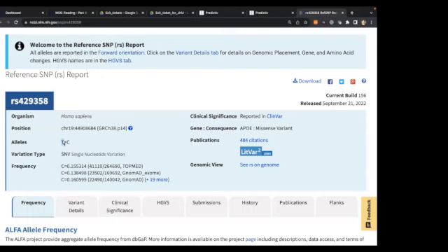Exactly. By default, even though a gene is located in the reverse direction, in the dbSNP database they always change it to the forward direction. So BRCA1 is actually located in the reverse direction, but if you look up the dbSNP data, every sequence is translated into the forward strand.